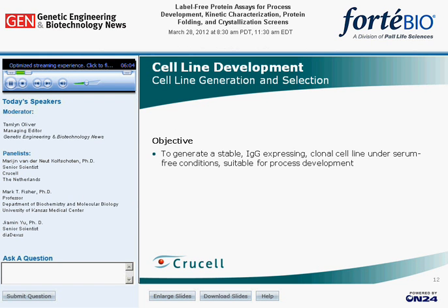The Octet-based IgG quantitation assay has been evaluated in our cell line development department. The main objective of our cell line development department is to generate high-performing IgG-producing cell lines suitable for process development.